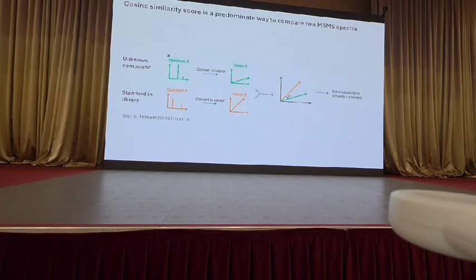And you can then compare the vectors of the 2 fragmentation patterns. If the vectors overlap, great, that means your spectra overlap. You have most likely that molecule found in the library. If the vectors don't overlap, then it's likely that the spectra aren't very similar, and you do not have the molecule that you are trying to find. And Tito will kind of go over this a bit more, what really is the MSMS, the fragmentation, and how this kind of works with the molecular networking in the next session.